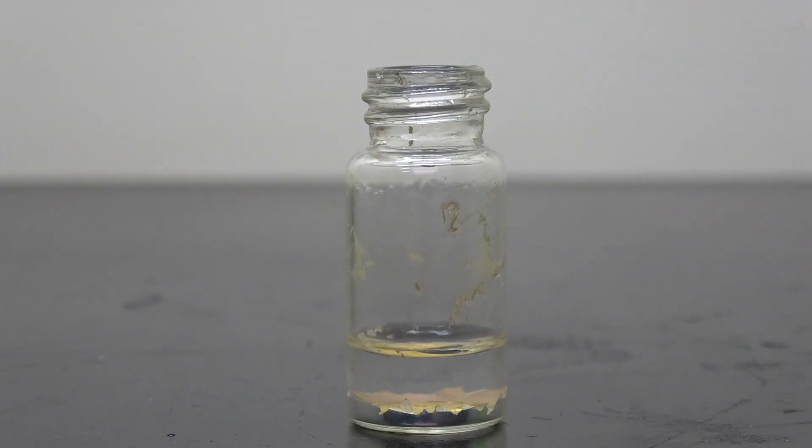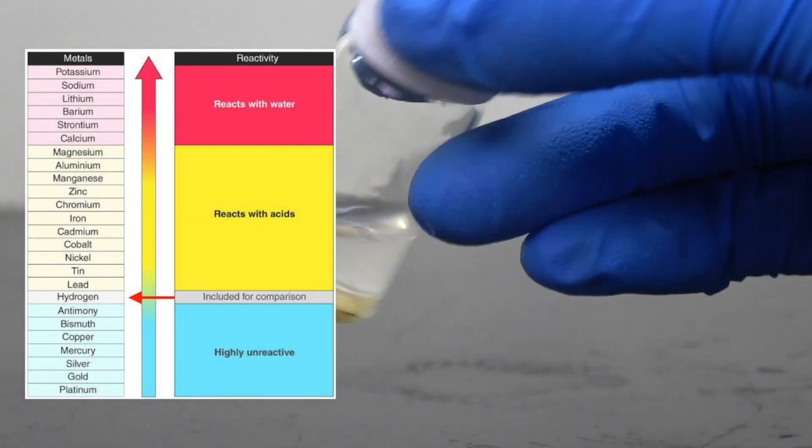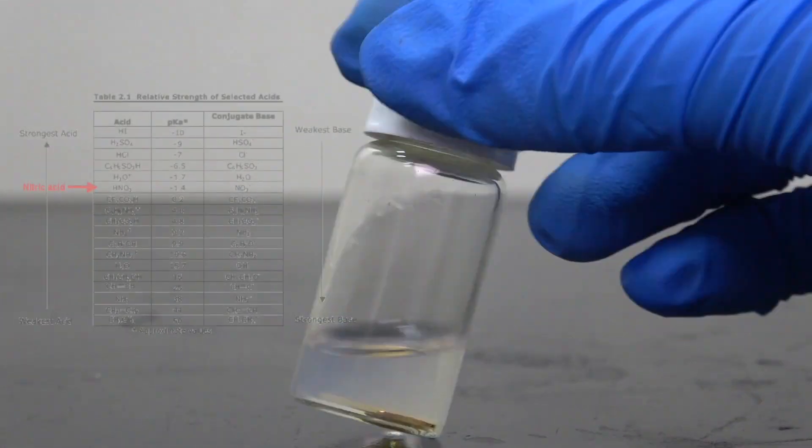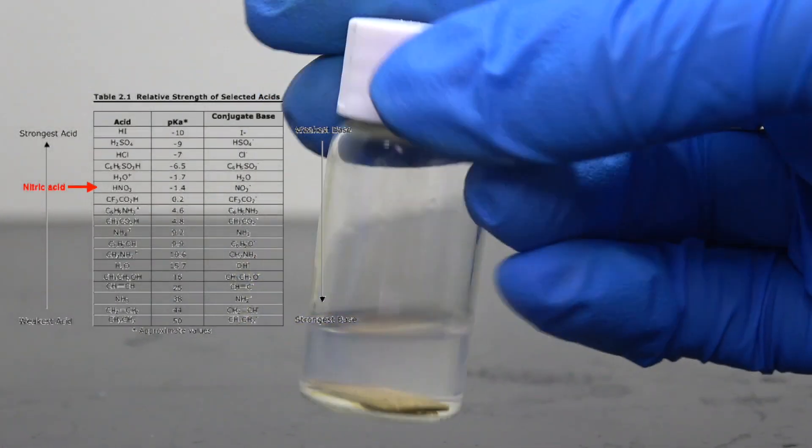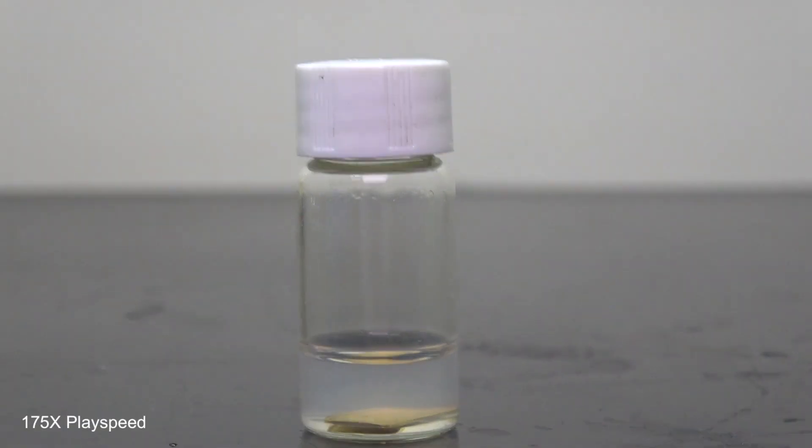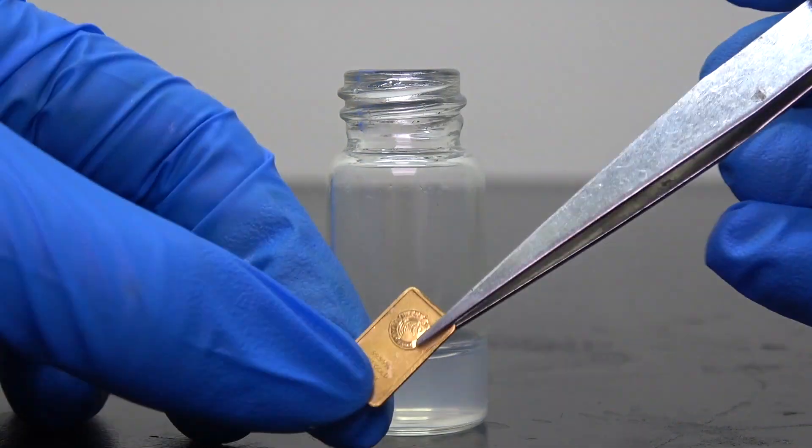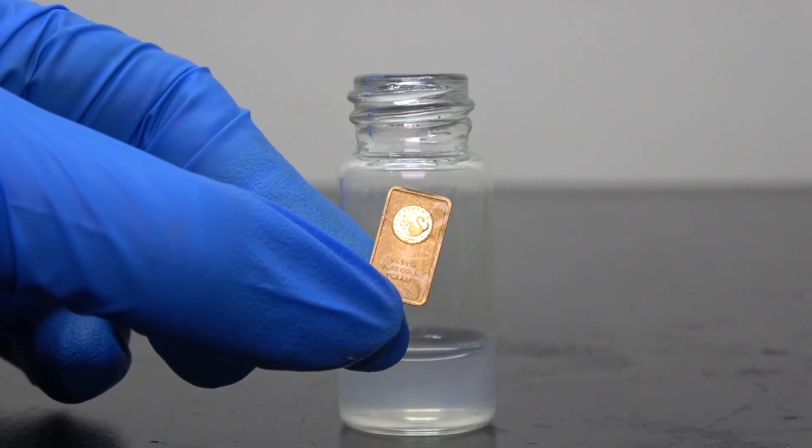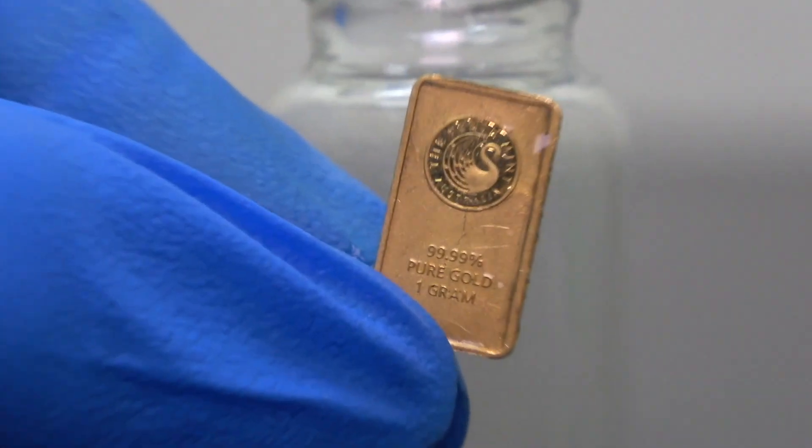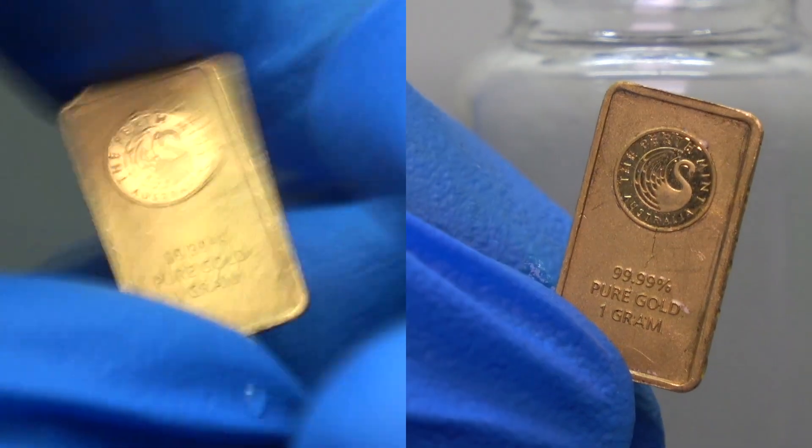Concentrated nitric acid is added into the vial. The remaining silver quickly dissolves in a matter of seconds. The oxidizing property of nitric acid allows it to dissolve metals beyond the point of hydrogen, for which many stronger acids fail to do. After letting the gold bar sit there for about 5 minutes, it was fished out. Upon close inspection, no visible damage has been done by the acid, though there seems to be a slight color change.